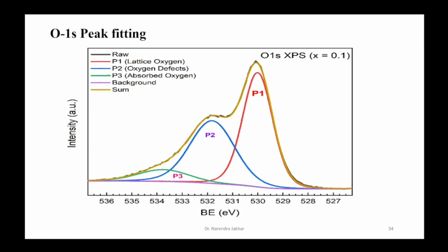Okay, so in this way, the oxygen 1s peak has an asymmetric nature. It is not symmetrically Gaussian, which is what a Gaussian function is, purely symmetric. But this peak has a hump here, and again a hump here. So this is asymmetric in nature. This asymmetry gives us an idea that different components may fit to this oxygen peak, so we are trying to fit different components in this oxygen peak.